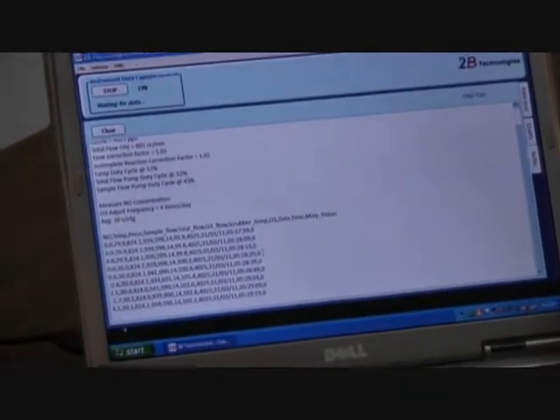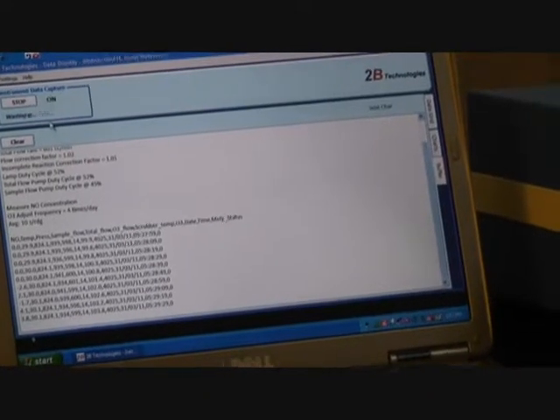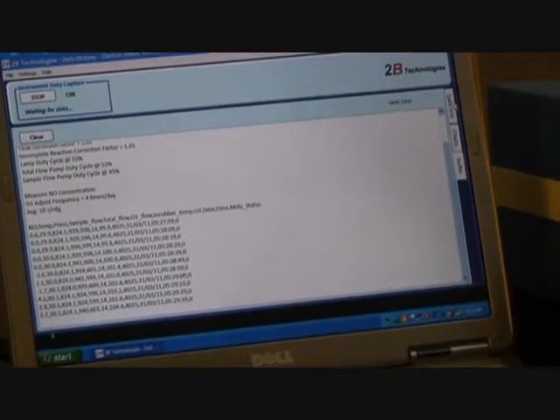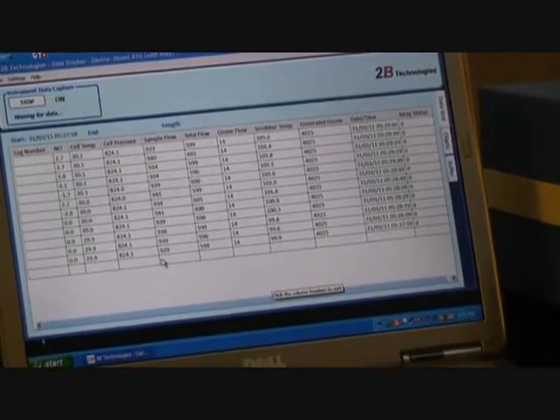So we're measuring nitric oxide right now, and we're using the data display program. Right now we're in the buffer tab, just looking at the raw data coming in. Now, if you're in NO mode and you have all the settings set up correctly on the instrument and the data display program, if you click on the data grid tab here, you'll notice that the data is filling into the columns where it is labeled.